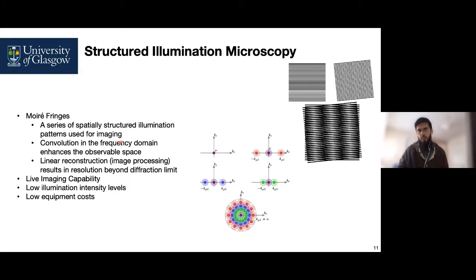This might seem contrary to what we see over here, that we require multiple exposures, but we can change the pattern very quickly and reconstruct in post-processing with very low latency, which enables us to observe samples with very high resolution as well as in real time.